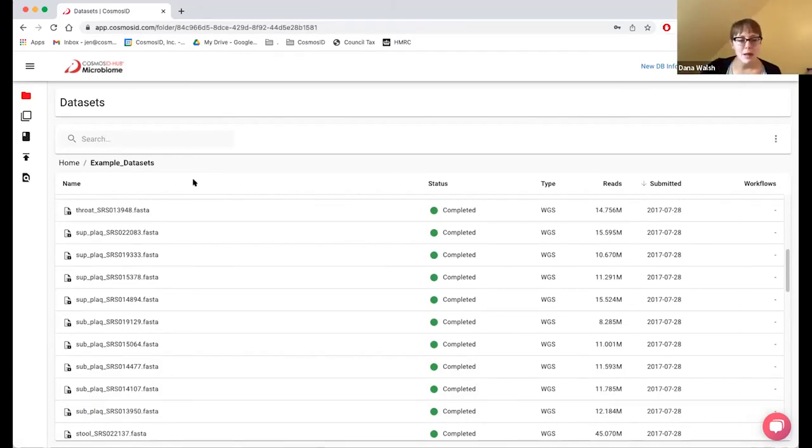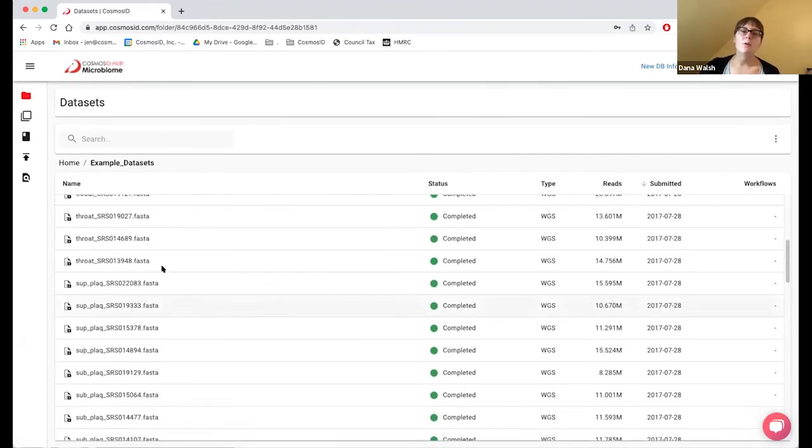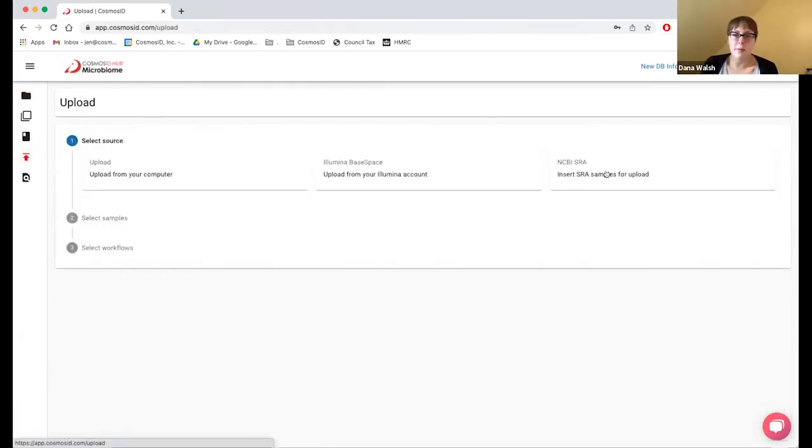Yes. I guess by global databases, we have an SRA import tool, so that will pull from data that's available on NCBI. I mean, if you can get it from other databases into NCBI, then we could upload it. Otherwise, we could definitely work with you to upload or compare to something else that's not available in NCBI. Yeah. Thank you both.